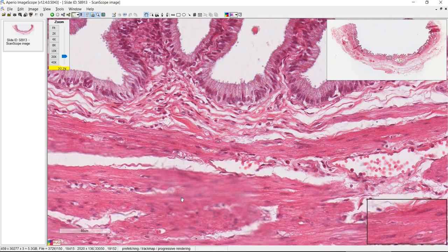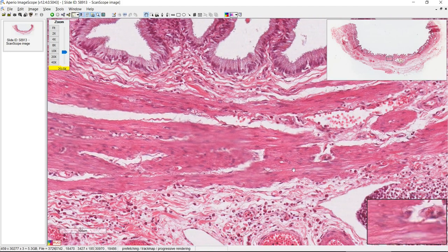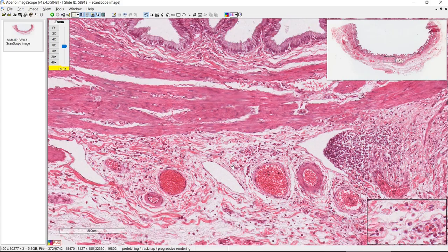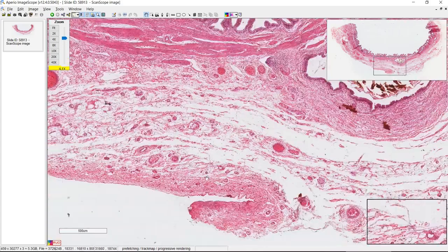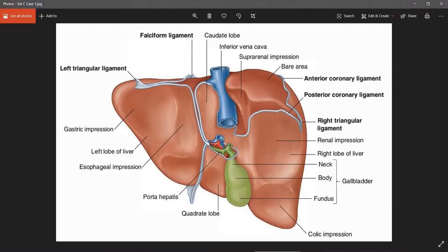Here you see smooth muscle making up the muscularis externa. Deep to that, we have either a serosa or an adventitia, and which one you have depends on where you are in the gallbladder. Part of the gallbladder is adhering to the liver — that part will be surrounded by adventitia. The free surface of the gallbladder faces the peritoneum, because the gallbladder is an intraperitoneal organ.